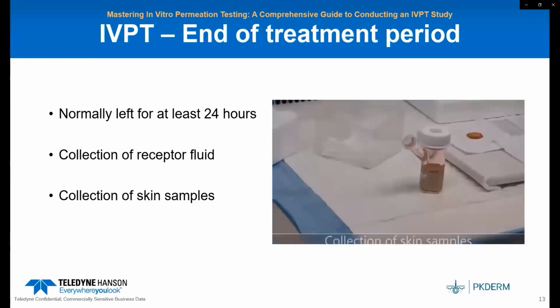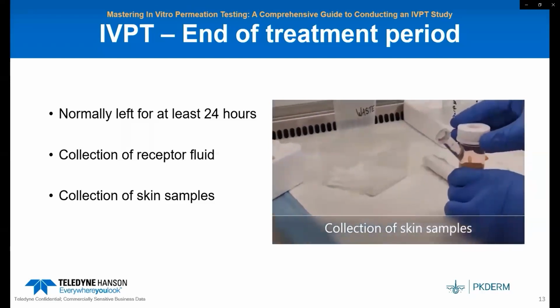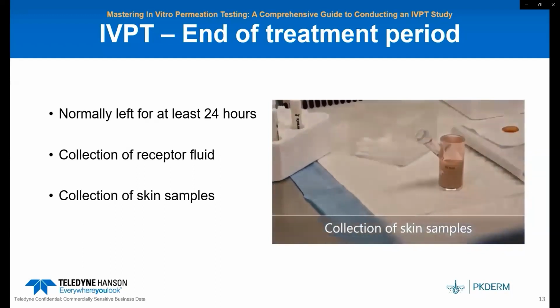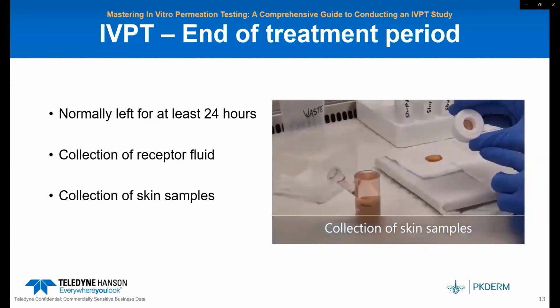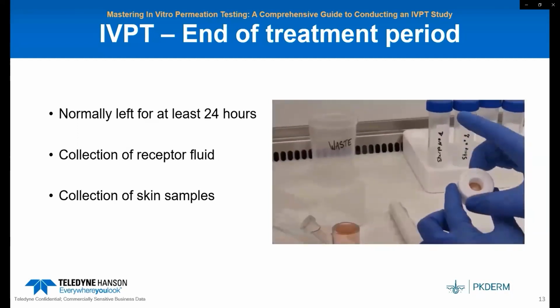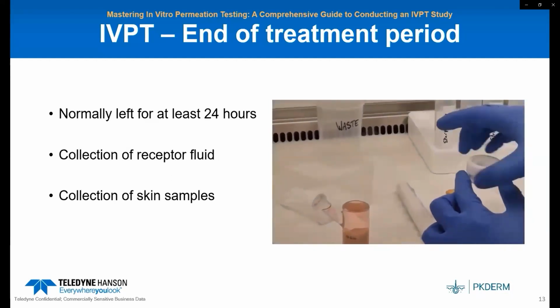And here you can see how we collect the skin sample from the Teledyne Hanson diffusion cell. So you can see clearly the treated area of the skin where we can see the applied formulation on the top of the skin surface.